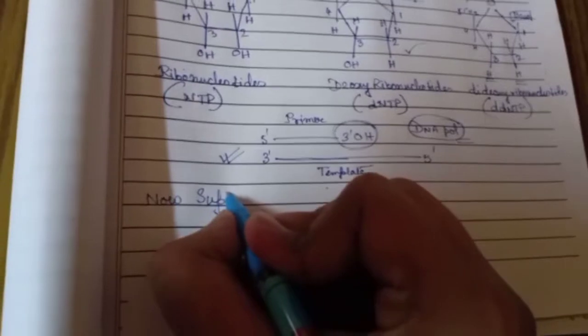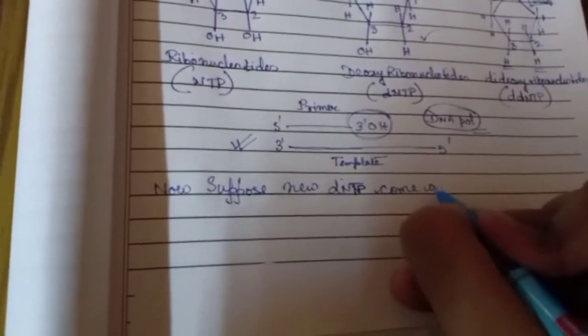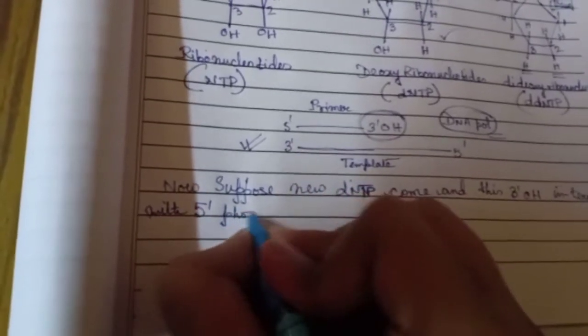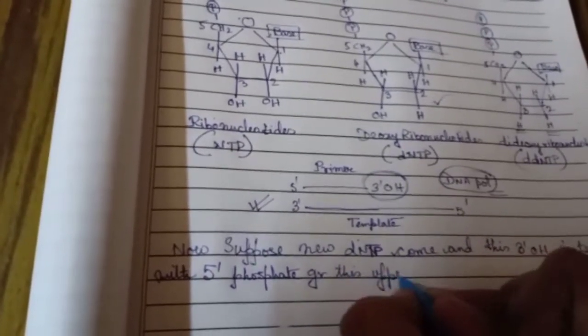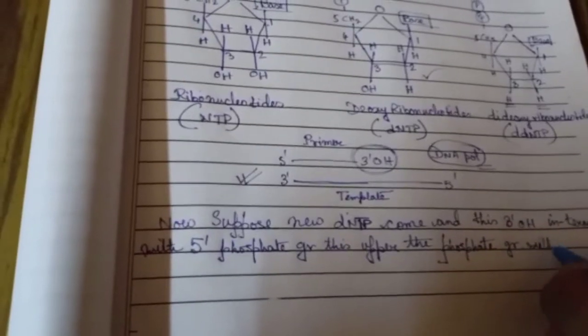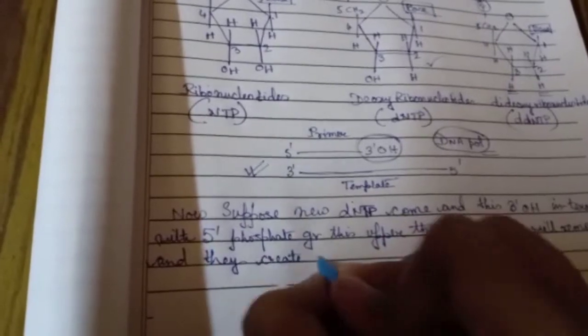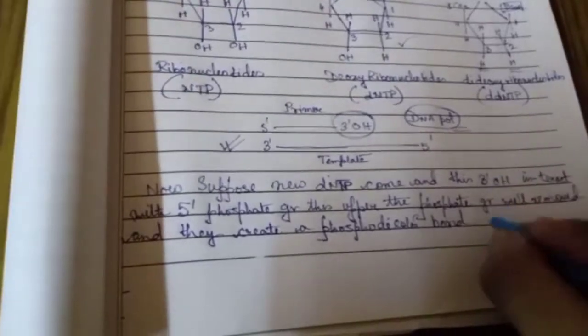Now let's suppose a new dNTP or deoxyribonucleotide comes, and the 3' OH group interacts with the 5' phosphate group. The upper phosphate groups are removed and they create a phosphodiester bond between the 3' OH and the 5' phosphate group, and in this way the polymerization can be done.